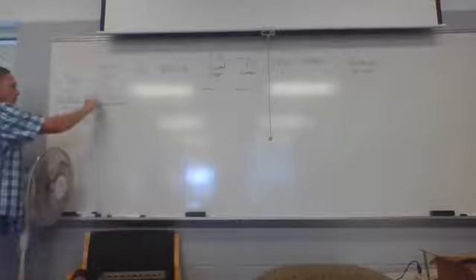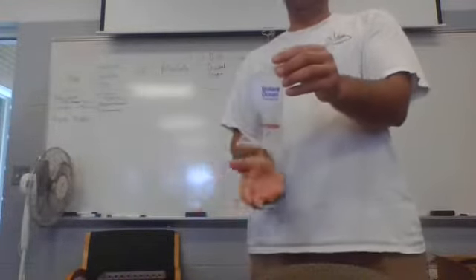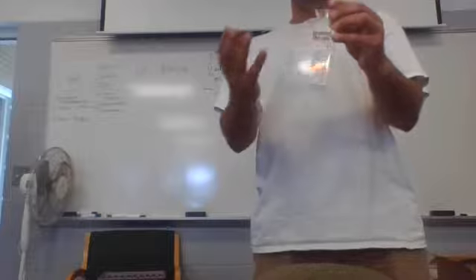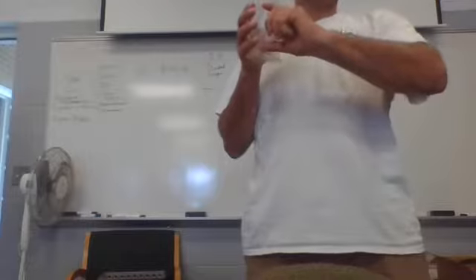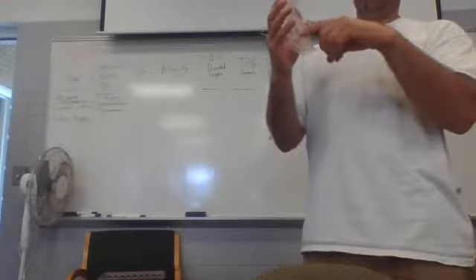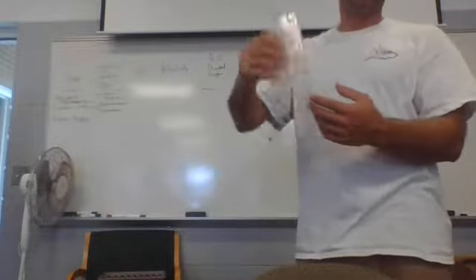What's another method? Hydrometer. A hydrometer, okay. This is a swing arm hydrometer. So it has a little plastic thing with a disc on there that has a certain density basically, and it floats up and it reads on where the tip of this is, reads on that scale and tells you the density, which is also related to salinity. This one does go from 0 up, but some of them only have a range that doesn't start at 0. It starts at some sort of medium salinity up to a higher salinity because it's hard to get a fine measurement at these lower ones. Biggest source of error I see with these is you get an air bubble on the arm that's going to make it go way up to the top, and you kind of got to knock it off.